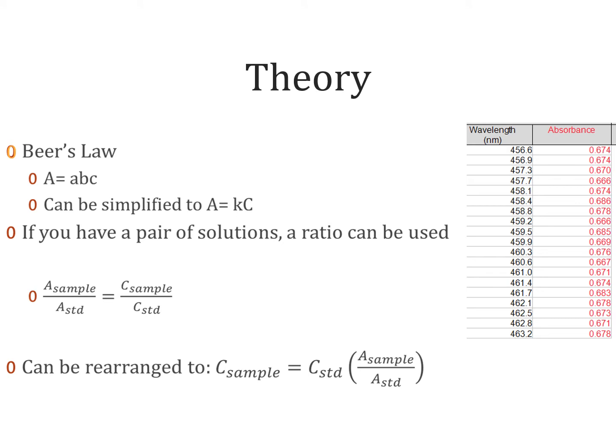So Beer's law gives us a way of relating the absorbance value and the concentration. You can see that it's directly proportional.